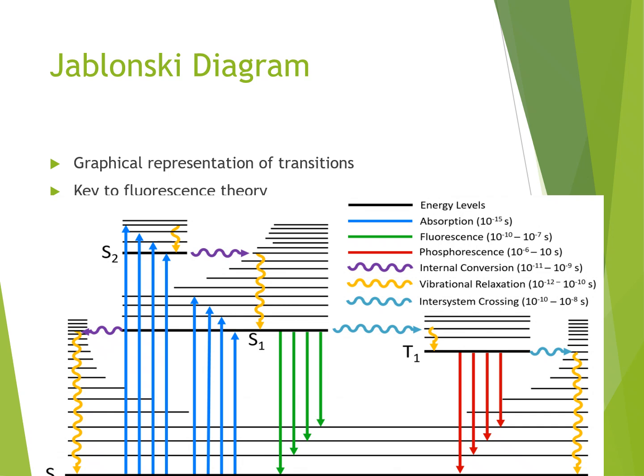In the case of fluorescence, after the internal conversion and vibrational relaxation, which are both non-radiative processes, the fluorescence process takes place.